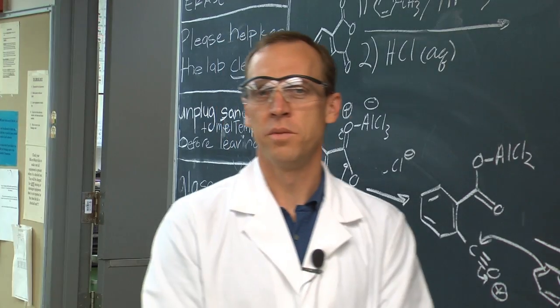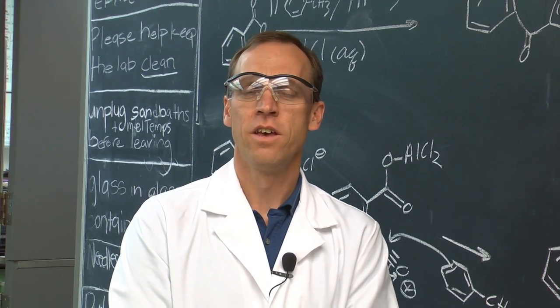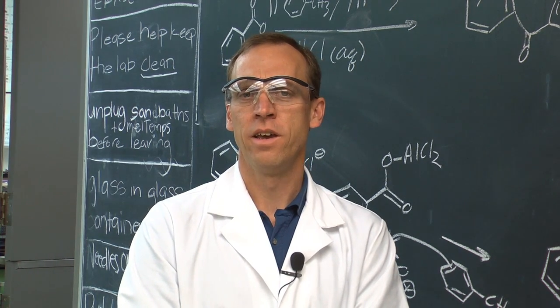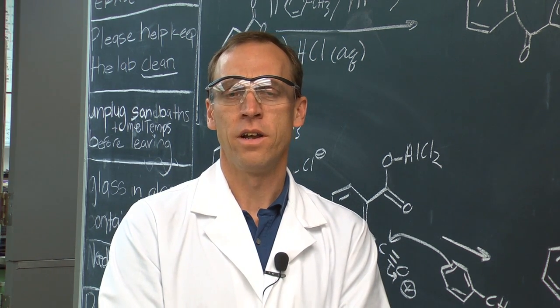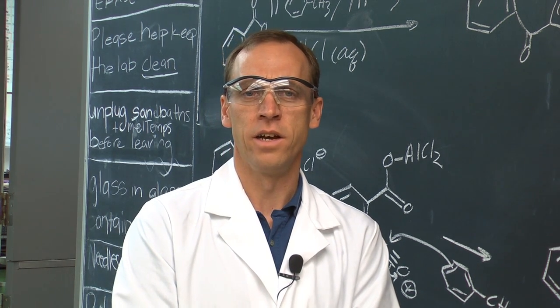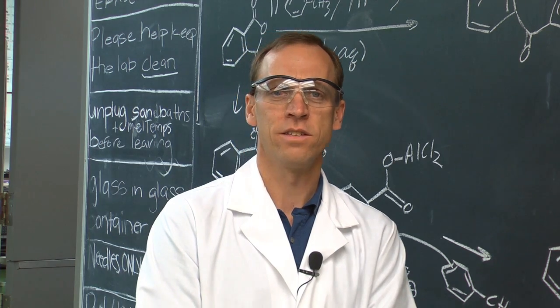Today we'll be doing experiment 14. This is an example of Friedel-Crafts Acylation. The first thing that you should do when you come into lab today is to turn on your sand bath as high as it will go and begin preparing your hot water bath, since that takes the longest time to heat up and get to the temperature you need for the reaction conditions.